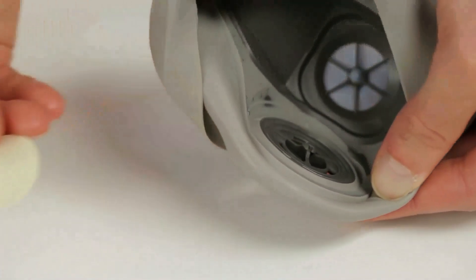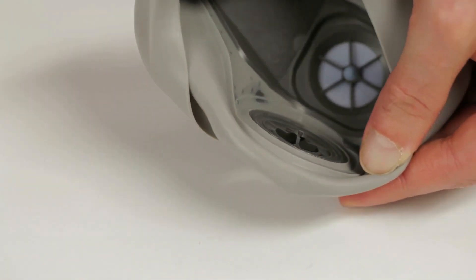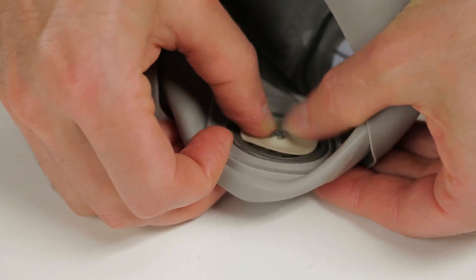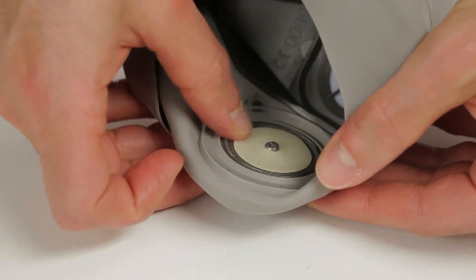To replace the inhalation valve, press the hole of the valve over the center post on the valve seat. Be certain the valve is fully engaged through the valve post and lays flat.